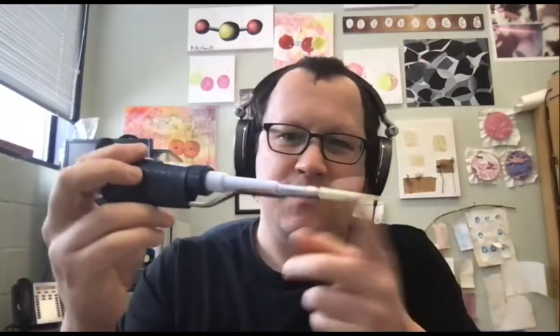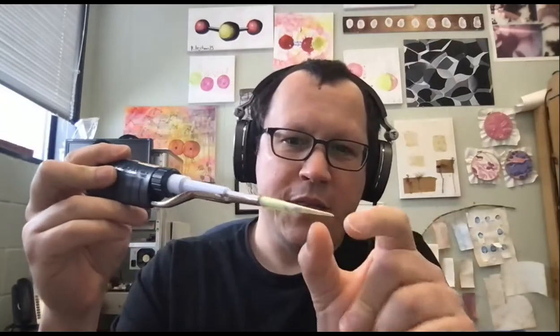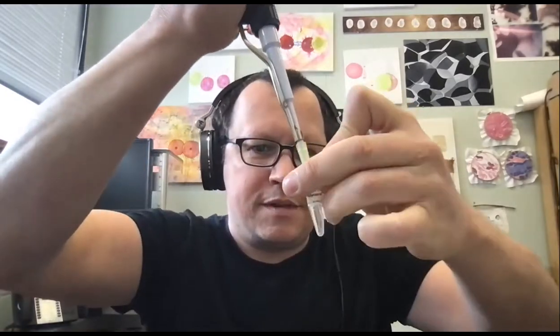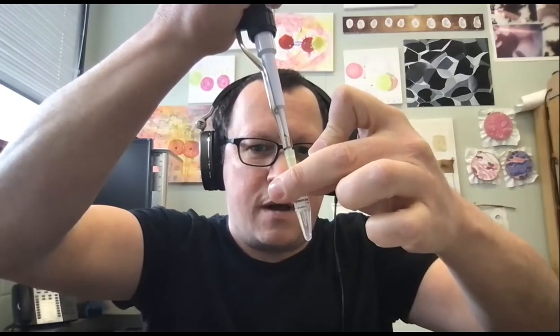When we go to measure things, the first thing we do is put a tip on the pipette. All pipettes have tips. You never use a pipette without a tip, because we don't want any liquids on the inside of this thing. We only want the liquids to be down in the tips. So we take our pipette, open the tube we're going to draw stuff out of, and push our plunger down to that first resistance point. We put our tip down into our liquid. See, the tip is down in the liquid there. Then we draw up. You can see that there's liquid down in that pipette tip.